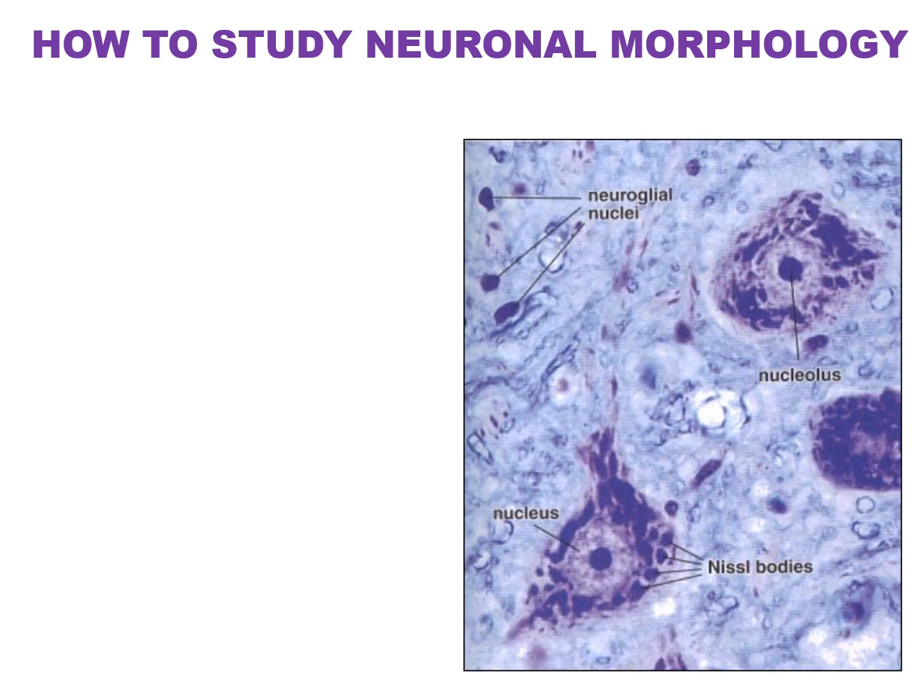How to study the neuronal morphology? Till now, in most of the classes we have studied the cells by hematoxylin and eosin staining. Neurons can be stained with hematoxylin and eosin stain, but certain components of the neurons do not take the hematoxylin or eosin stain. Especially the fibers do not take this hematoxylin and eosin stain. So for that we use special stains.